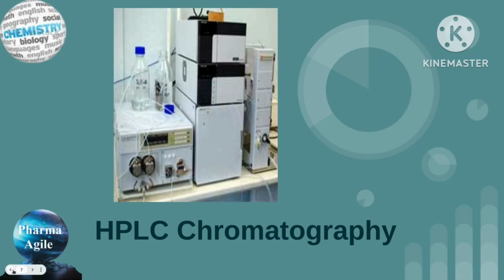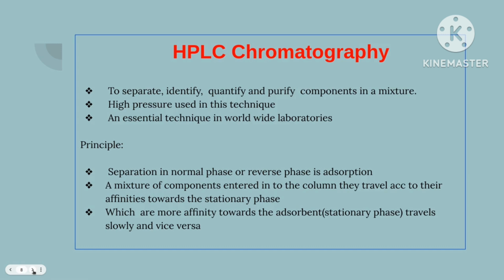This is Devi Sarojini. Now I am coming with another very important topic, HPLC chromatography. HPLC is mainly used in the pharmaceutical industry. So in this video I will discuss the principle of HPLC, what the stationary phase is, what the mobile phase is in HPLC, and the different types of HPLC due to elution technique and due to phase. I will discuss everything one by one. Let's start this session without any delay.